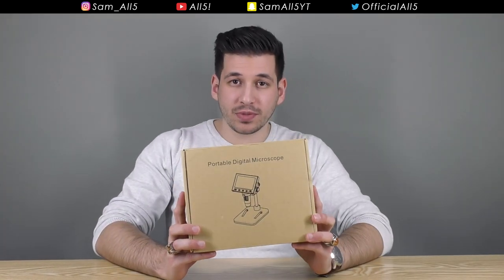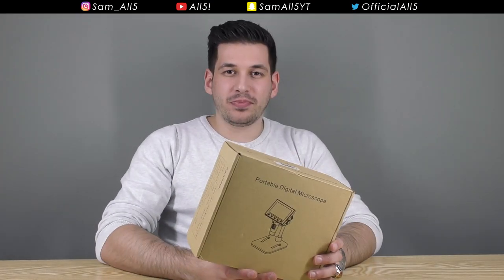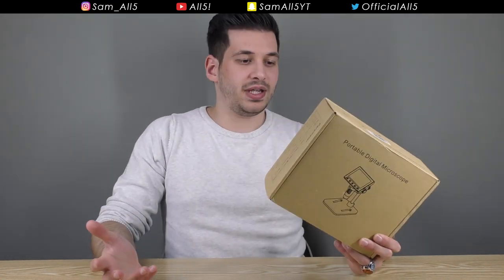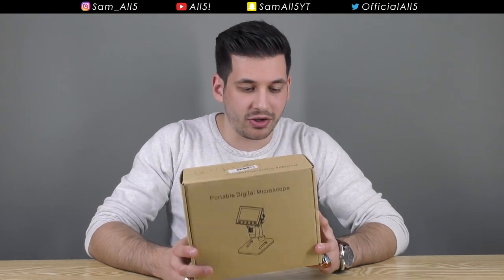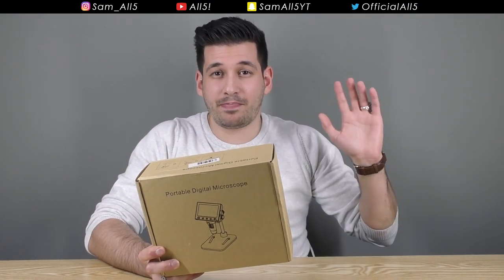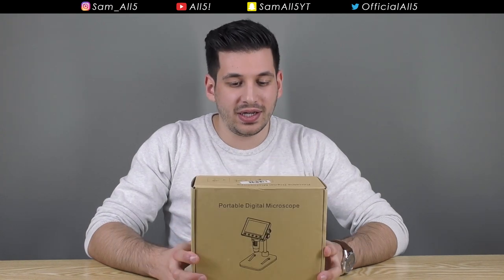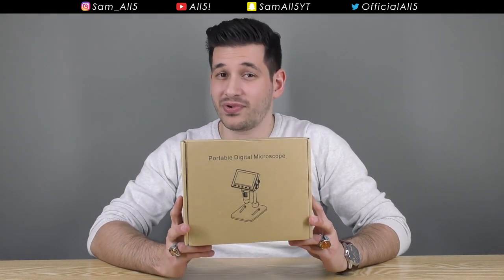Today I have a portable digital microscope. I don't know about you but digital microscopes seem like expensive pieces of kit, and that's probably because I've got no experience with microscopes. I don't work in any field that requires me to use a microscope, so for me it just seems like equipment you'd find in some high-tech lab that costs thousands of dollars. But I actually discovered you can pick up microscopes for pretty damn cheap.